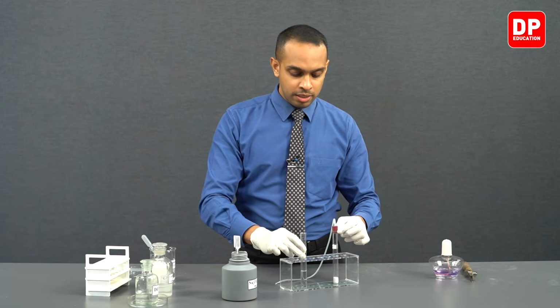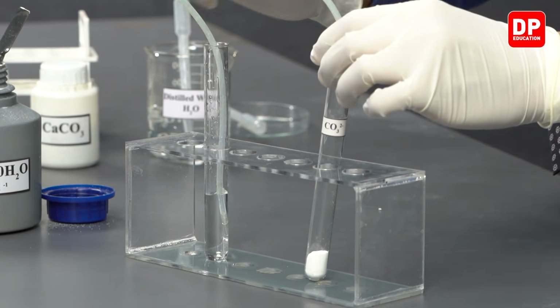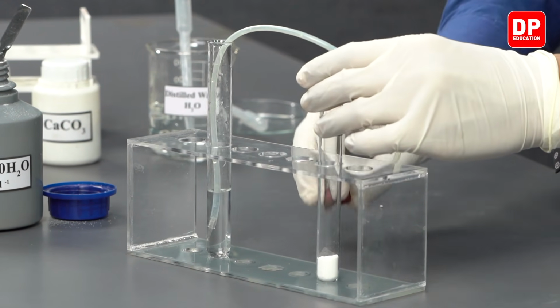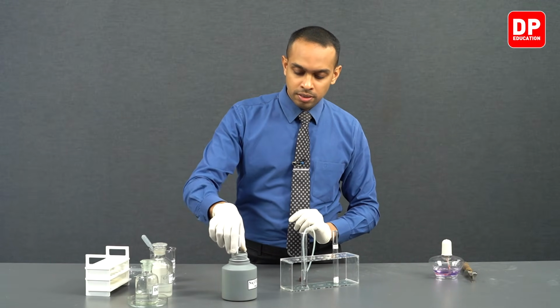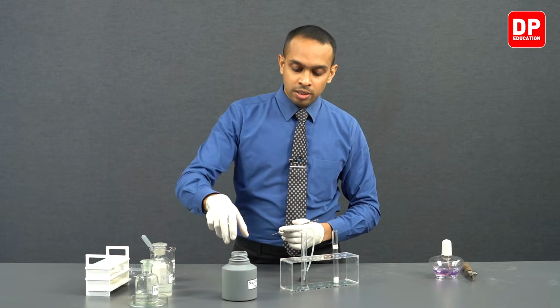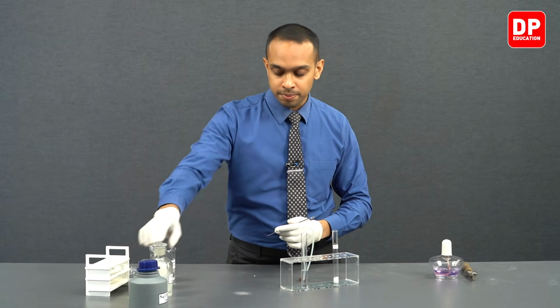So let's place that test tube over here, and we can insert the delivery tube into our lime water solution and proceed to add our HCl to our sodium carbonate solid we have here.